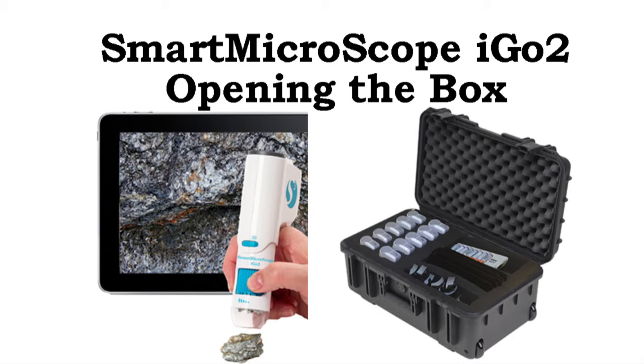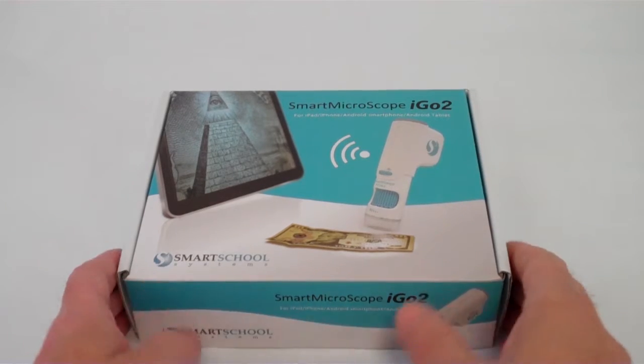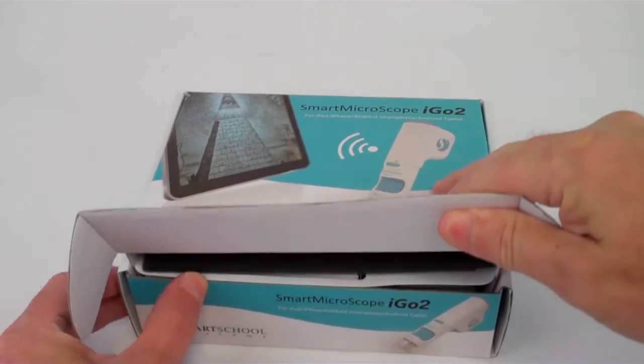SmartMicroScope iGo2: opening the box. As we open the iGo2 box, we see documents on the top.